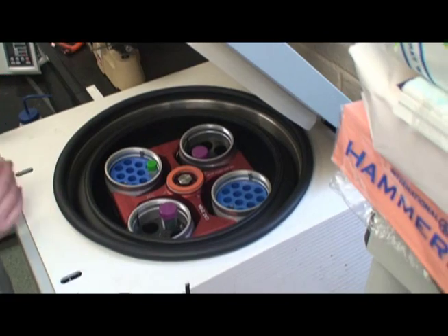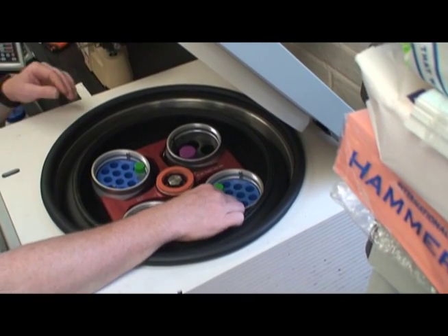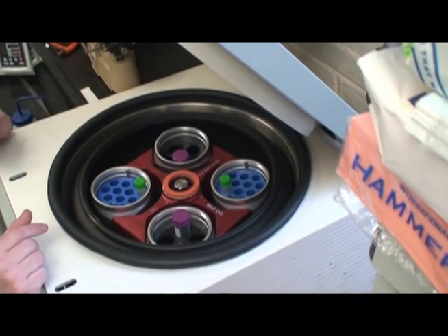Now, smaller test tubes can be inserted into the centrifuge, and once again, the buckets can be slightly rotated to ensure that the tubes are directly across from each other.